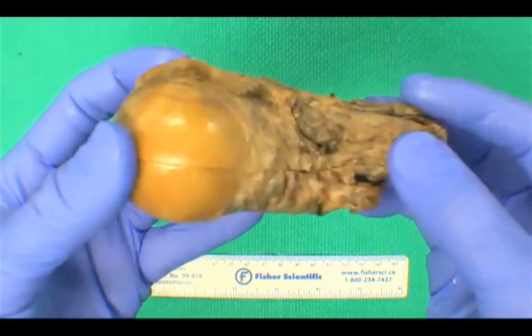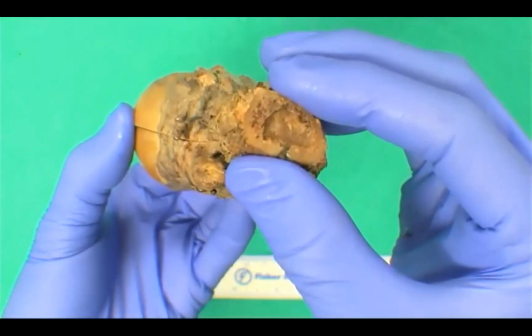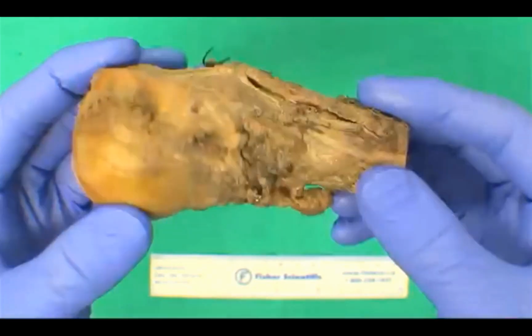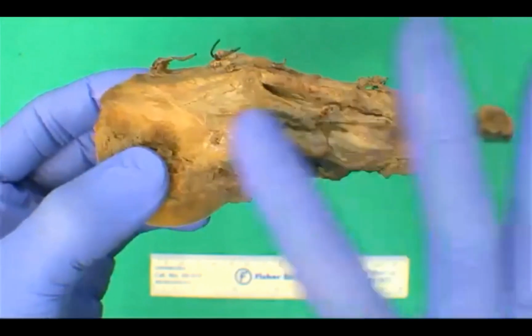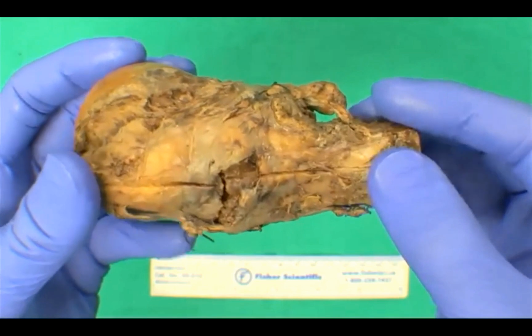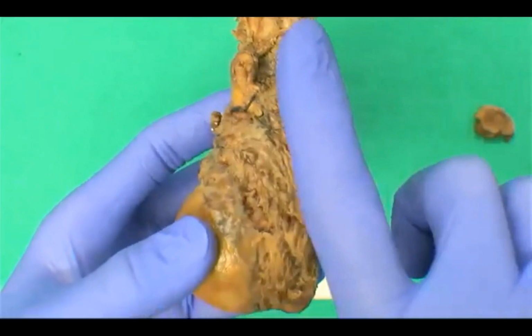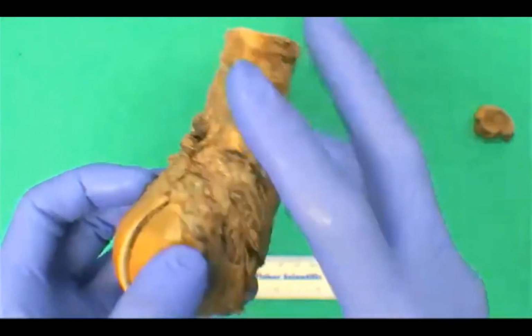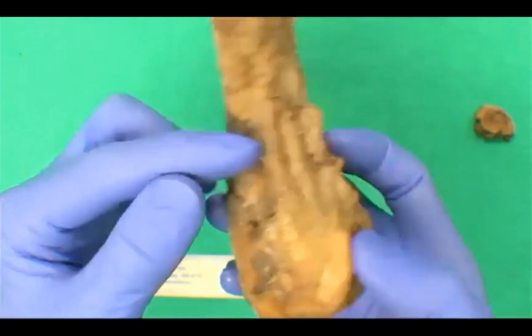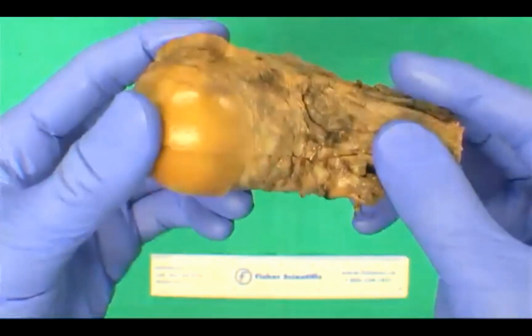Okay, let's get back to this margin conversation. Technically looking at this specimen, there's truly only one margin, the distal bone margin. And that's here that I've taken off on the saw already. Given the nature of what we have, you can consider that there's actually some more soft tissue margins, but the surgical technique here didn't include a lot of soft tissue surrounding the specimen. But you can consider that there is an anterior soft tissue margin. There's a little bit of a medial soft tissue, posterior, and lateral as well. So you could, in theory, bump this up to 5 different margins.